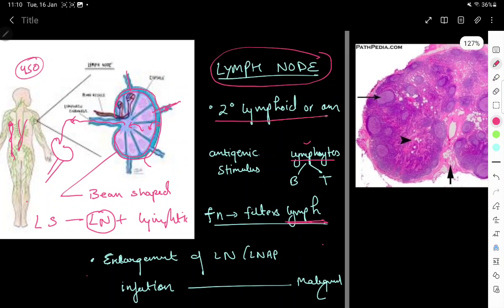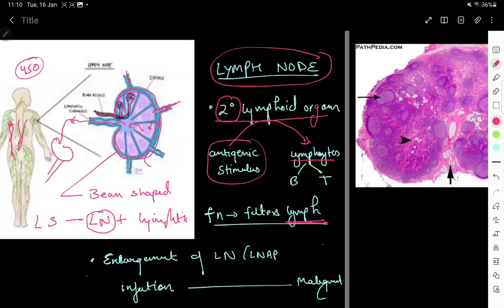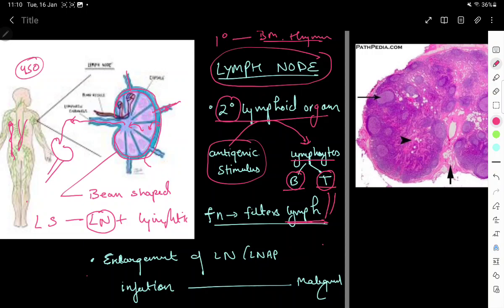The lymph node is a secondary lymphoid organ, meaning it needs antigenic stimulation to produce lymphocytes. Primary lymphoid organs include bone marrow and thymus, which don't need antigenic stimulation. With antigenic stimulation, the lymph node produces B and T cells, which protect our body in case a toxin, virus, or bacteria reaches it — filtering the lymph and fighting infection.